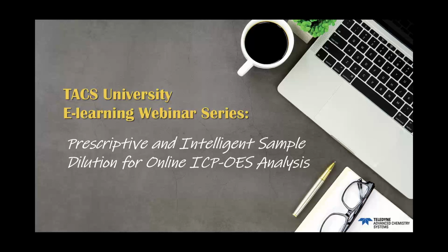One of the systems that I'm responsible for is the SDX system, which I'll be discussing today. But today I'm going to describe prescriptive and intelligent sample dilution and how that is applied to ICP-based analysis using this technology.